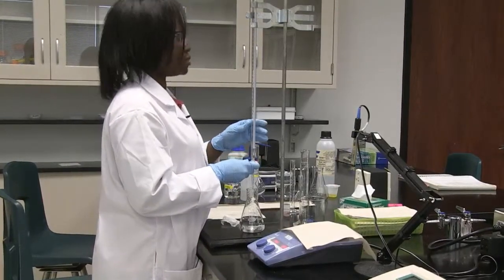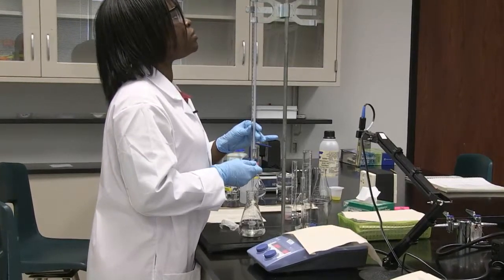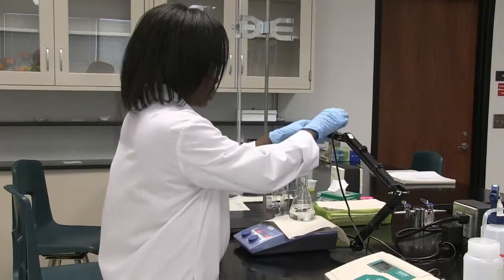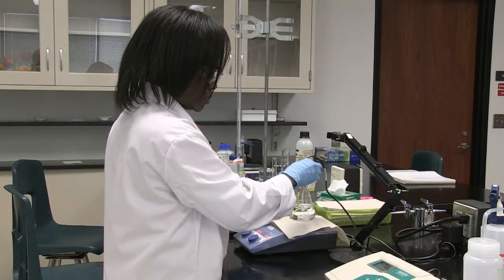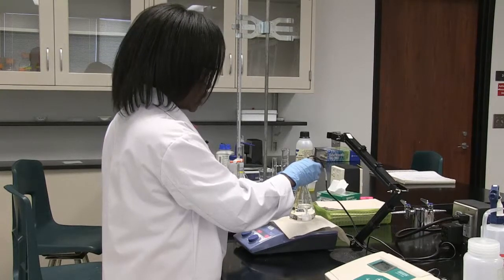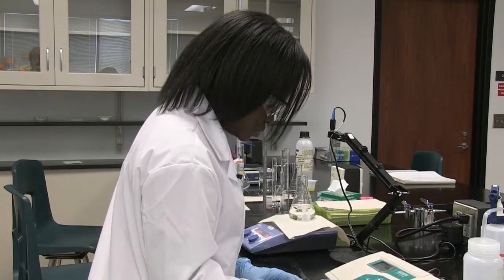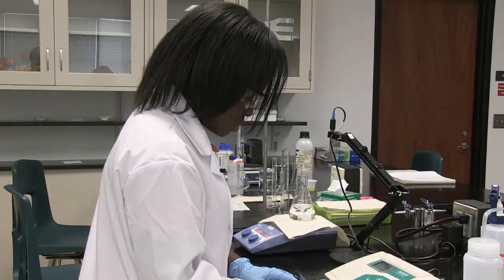When I add 0.5 mL, the volume in the burette goes to 15.5. I stir on the stirrer plate and then record the pH while it's being stirred. The pH did not go up by much, which is expected since it's a buffer — it's now 4.77 after adding 0.5 mL of base.